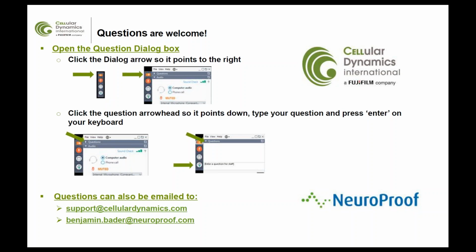So, in our opinion here, the reference is needed to really judge the quality of the human neurons. If I do a compound screen, for instance, just in human cells, maybe I see a 70% effect size in the human neurons. So how can I say this is good? Why is it not 100%? Now, if I use a reference model like mouse, and there I see maybe just a 30% effect size, then the human model all of a sudden is much better than the mouse model. So this is how we can use this reference mouse model.